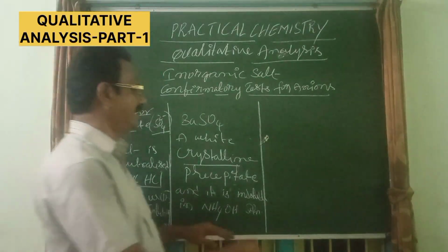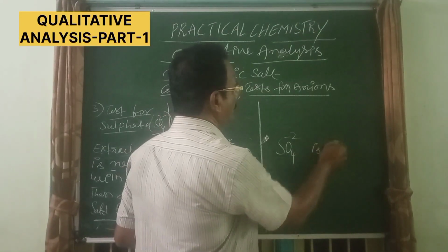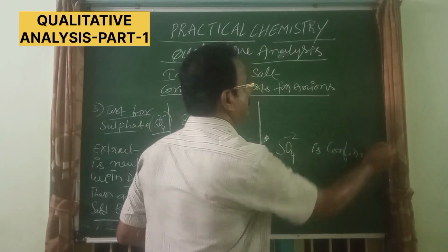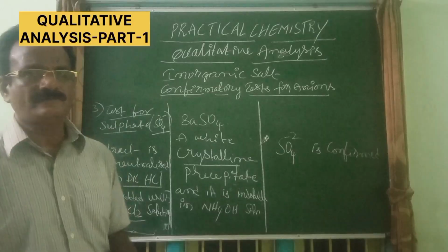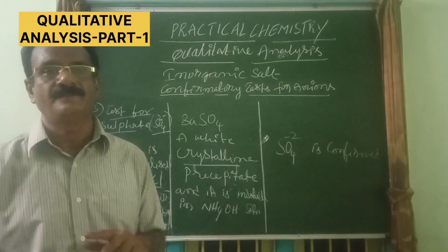Okay, so then we can confirm SO4 2 minus. So this is about the confirmatory test for sulfate.